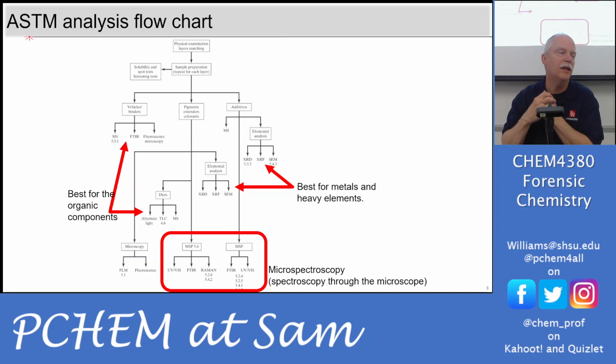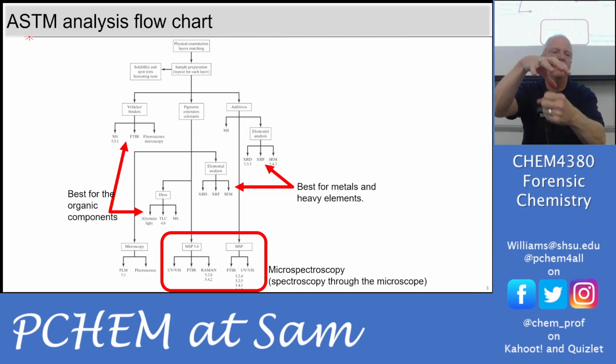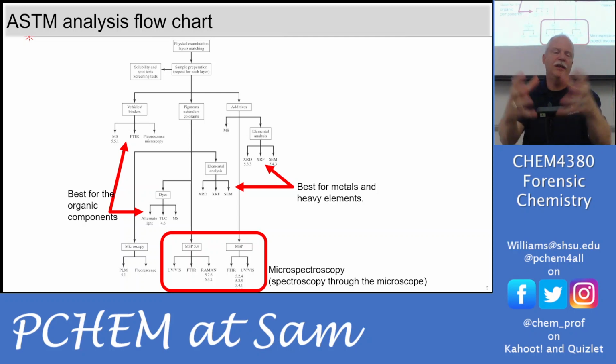So it's pretty slick. It's a little tricky because glass will absorb infrared light. And so your optics either have to be salt or mirrors. And so the objective doesn't look like a regular microscope objective. It looks more like a telescope, which uses a Cassegrain optical system, sort of these nested parabolic reflectors, and you shoot the IR through those. And so you can still get like a 20x objective, but using mirrors.